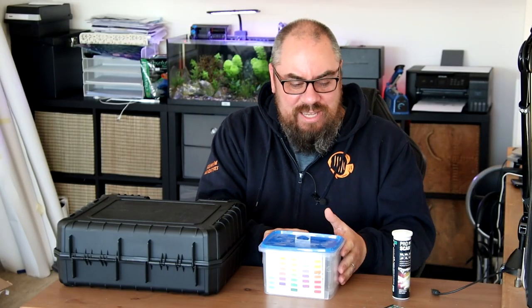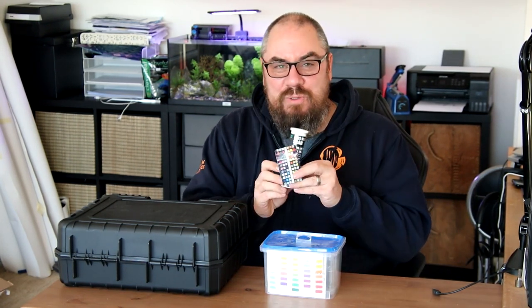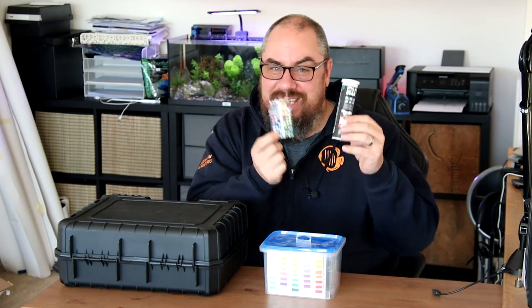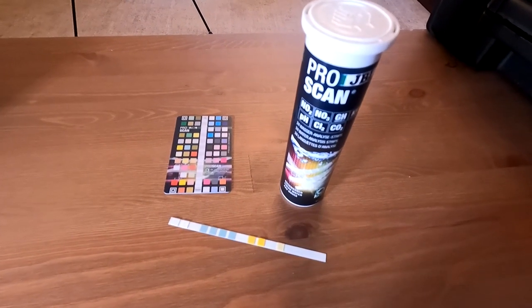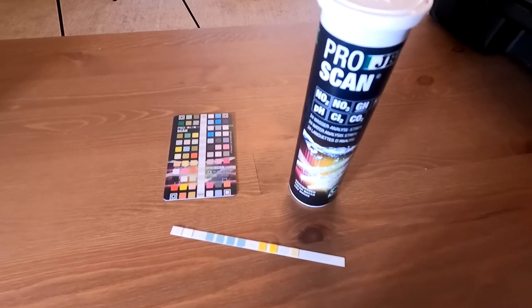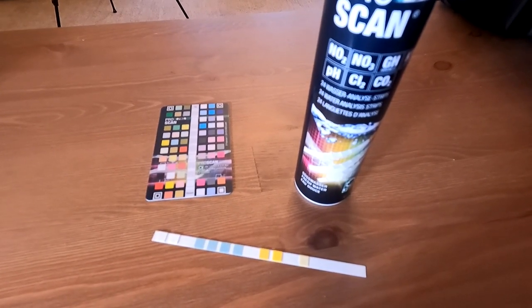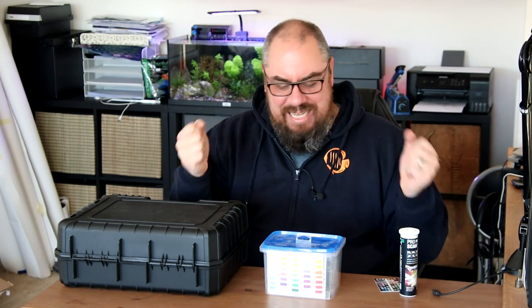Traditionally you have your dip tests. In this case I've got the JBL Pro Scan, where you dip a strip into water and compare it to a chart. I really like the JBL Pro Scan — there are other similar ones around. You take the strip, hold it against the card, scan it with your phone and it spits out some numbers. Simple, quick, easy — love it.